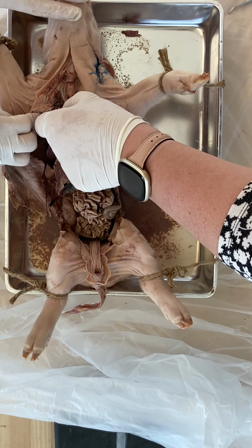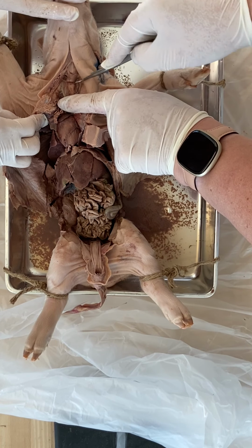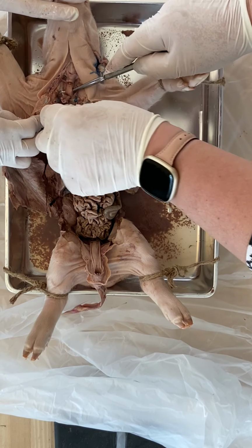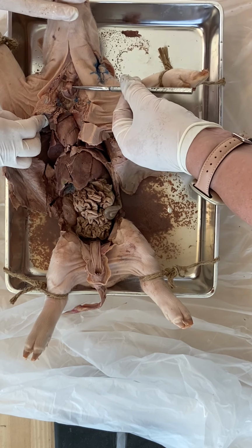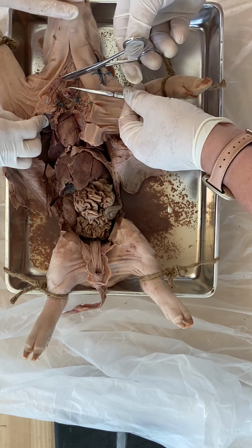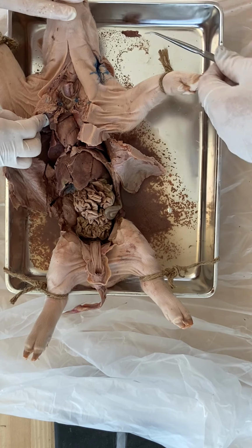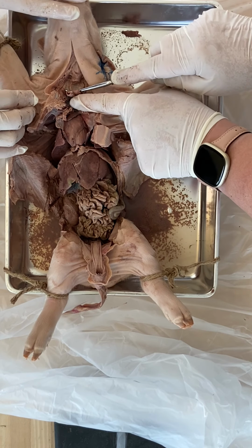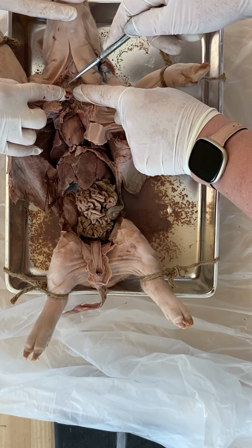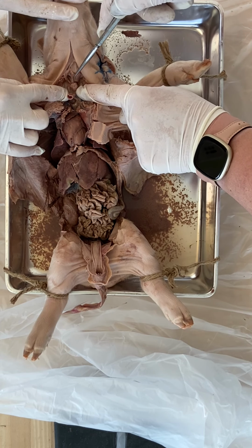And then behind it, hand out of the way, behind it we have the esophagus. So here is the esophagus. Let me see if I can, I've already cut it a little bit. So here, the two together, trachea in the front, esophagus at the back, closed. But you can see the layers. There we go. So there it's open, but nothing to hold it open.